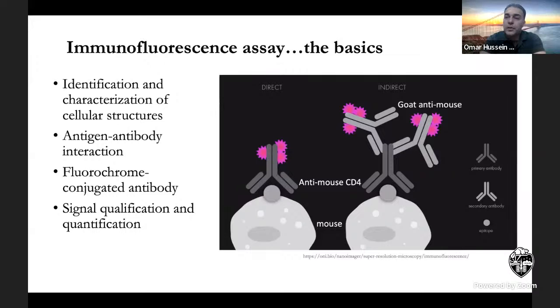Dr. Shakira, I have a question. When you add the DAPI at the last step to stain the nuclei, after that do you put PBS or formaldehyde to keep the cells wet? What have you chosen?